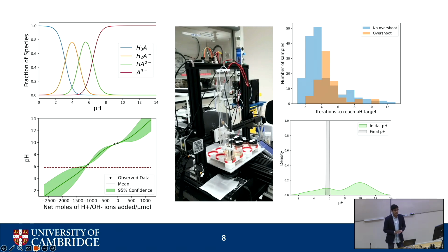And you can see we had samples with a broad range of starting pHs, all of which we could titrate to the set point. And we've also released 4 blueprints for how to build this pH bot.